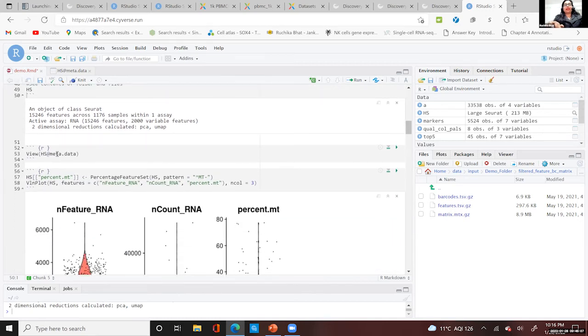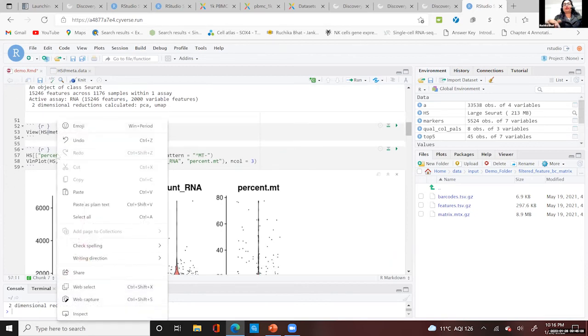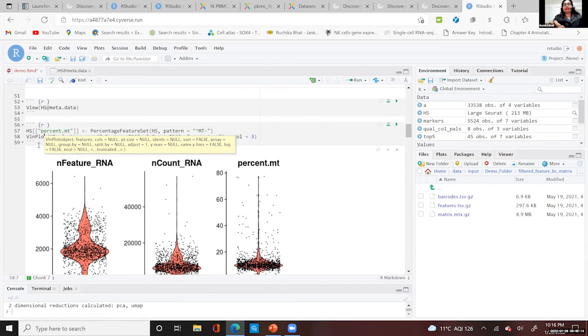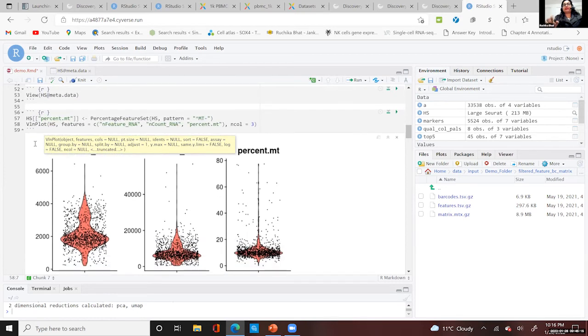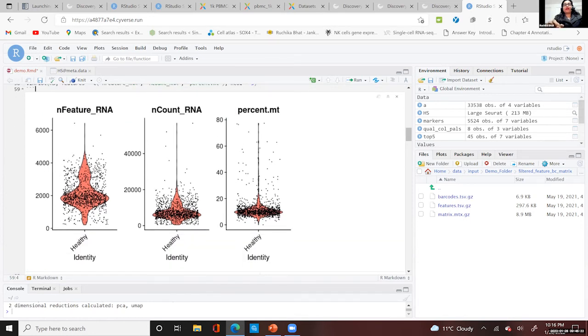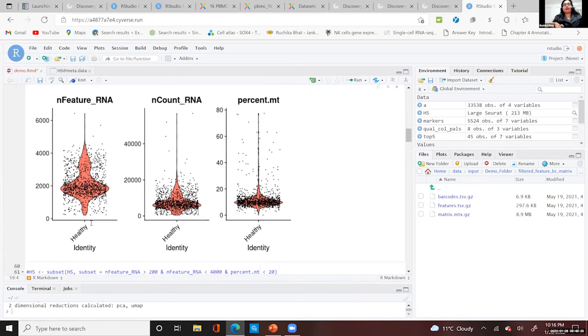And if we want to check how we do the quality control, we will generate this using this plot. This is the first step that I want to bring to your notice. For this data, you see the average range here is almost close to 200 to 4,000, where the behavior of most of the cells is within this. And there are very few multiplets which are beyond 4,000.